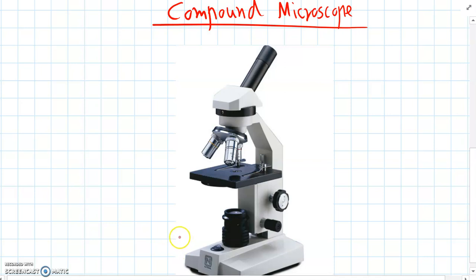So let's start at the bottom first. The bottom section is called the base. And there are a couple of parts on the base. Here we've got the switch which turns the light on and off.